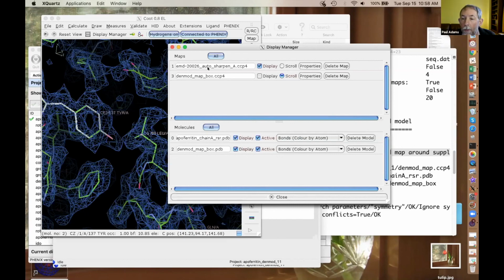Okay, so another question is, can iterative model building and density modification of original maps lead to further improvements? Yes. We're going to do model building in a little more than a second, and yes, that can be used. Those models can then be iterated to improve the process. The overall improvement is not dramatic. Maybe someday when this is all done perfectly, it will be.